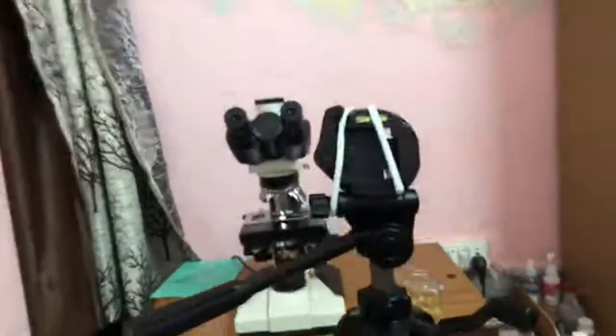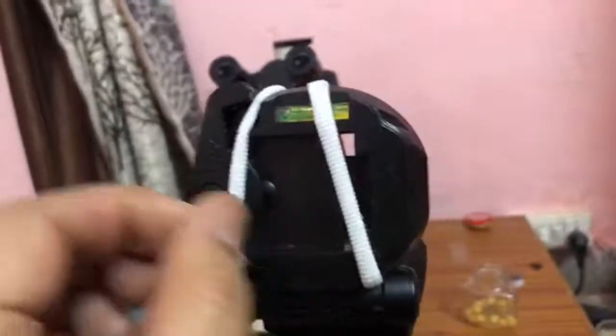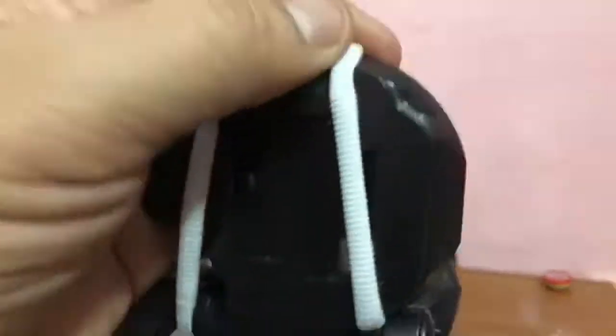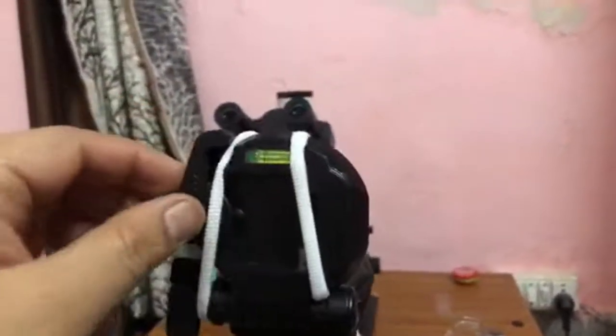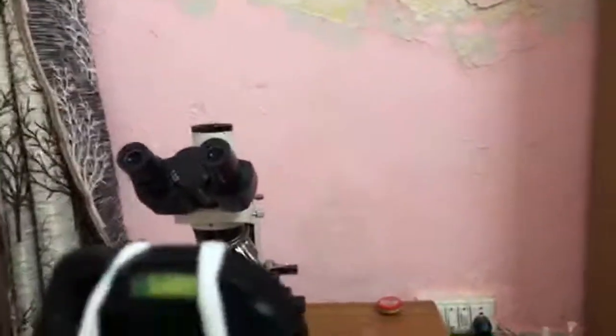My arrangement is pretty simple. That is my microscope. Here is a normal tripod, and I have this little arrangement that I've made, some elastic bands on this particular platform. I'll be sliding the microscope through this, then bring this microscope lens, sorry, not the microscope, I'll be setting my mobile phone between these rubber bands, and then I will align the mobile's lens with the microscope lens, and then it will be relayed. So bear with me as I do it.